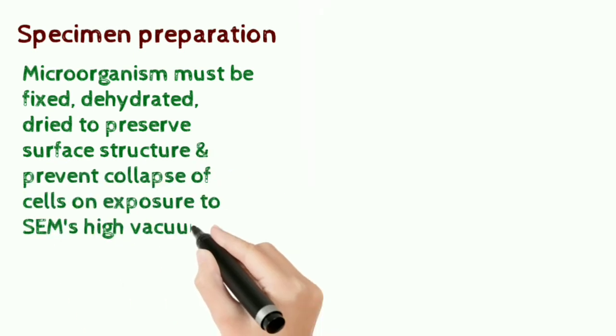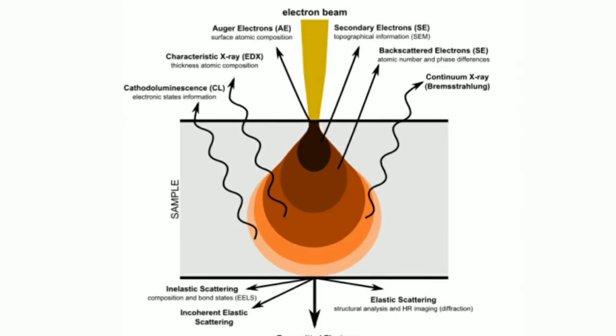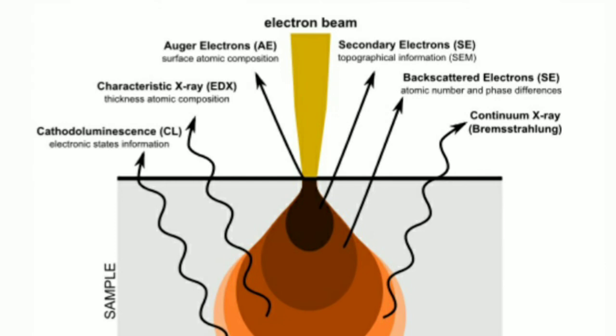SEM's high vacuum. See the diagram on the screen to know about the information that we can get by using transmission and scanning electron microscopy.